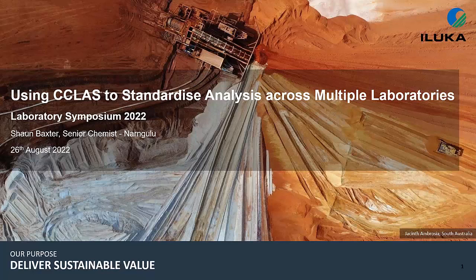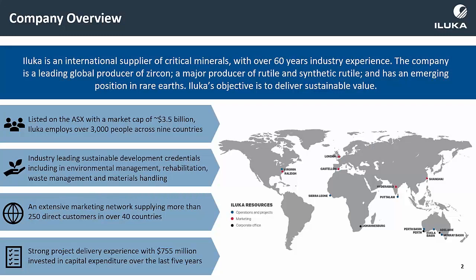So the topic that I'll be covering today is using CCLAS to standardise analysis across multiple laboratories. My topic will cover a bit of a history of Iluka and the laboratories that we run, our CCLAS installation prior to an upgrade in 2016, what our CCLAS system became, and then how we were able to standardise our analysis.